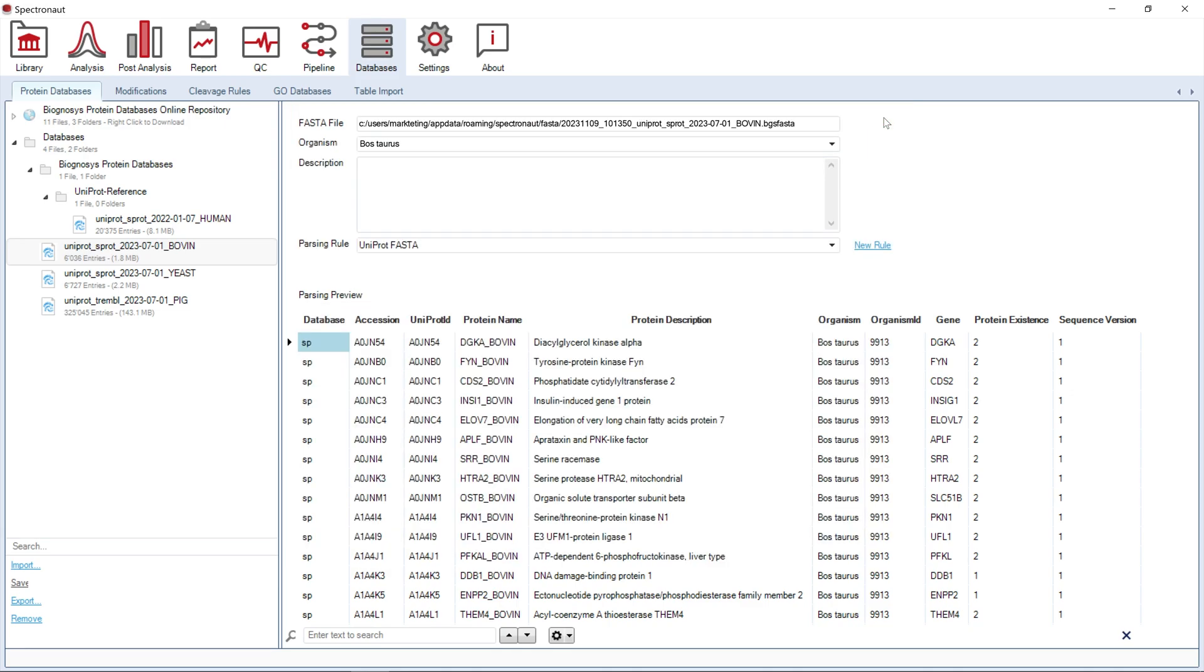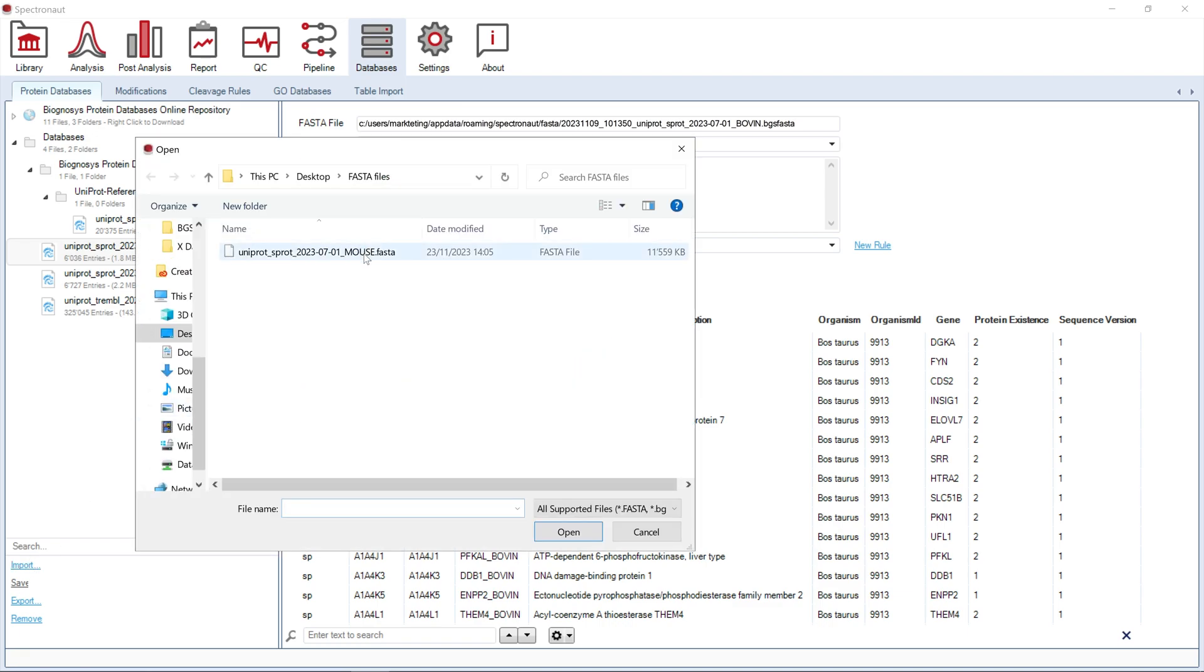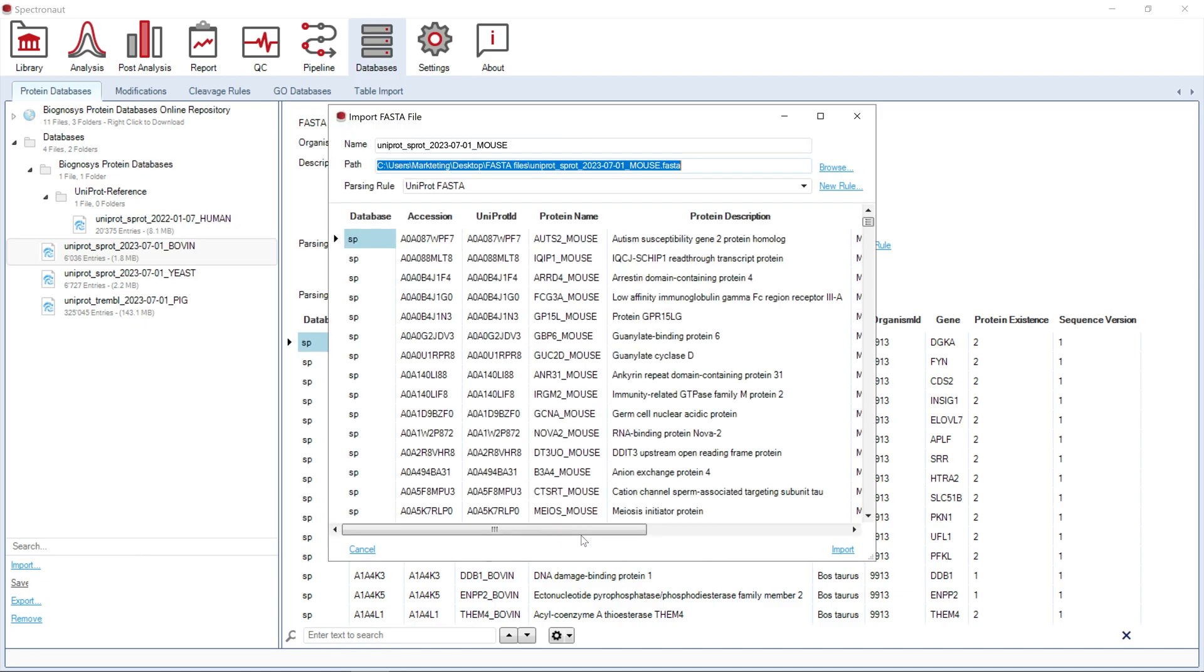Using the Import option, you can start importing a new Proteome database from FASTA. Spectronaut will try to find an appropriate parsing rule for this file format from the list of already specified rules.